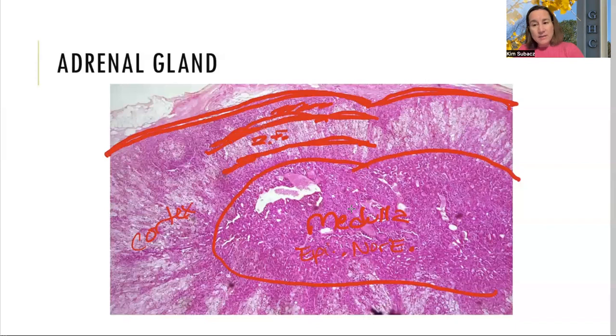And then our last but not least part of the adrenal cortex, the middle part as you approach the medulla, is going to be our gonadocorticoids that we find in the zona reticularis. So we'll say this one is ZR, zona reticularis. And with the zona reticularis, it's going to release gonadocorticoids. So think of gonads, think sex hormones, your androgens, testosterone, estrogen, those kind of guys. Those are gonadocorticoids, and they come from this zone right here. It's going to be your zona reticularis, and the category that it produces is gonadocorticoids.